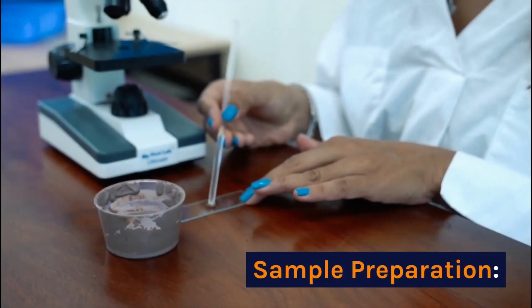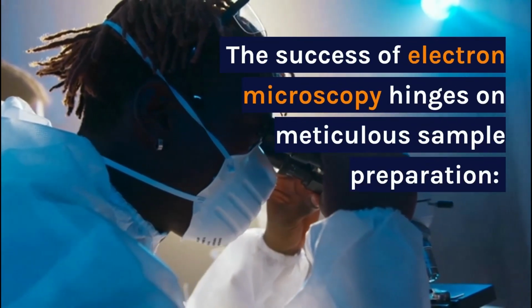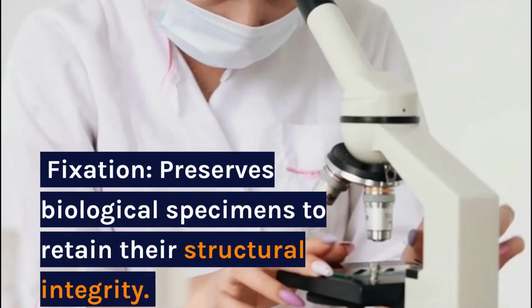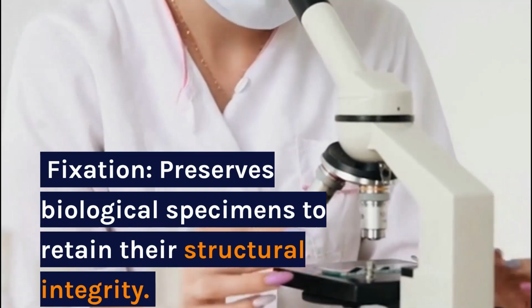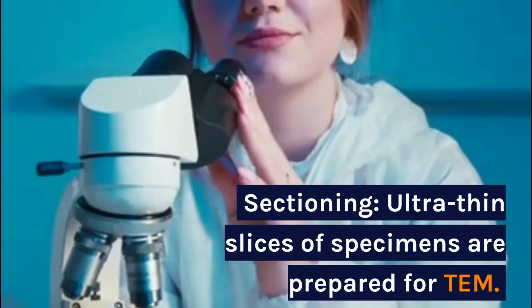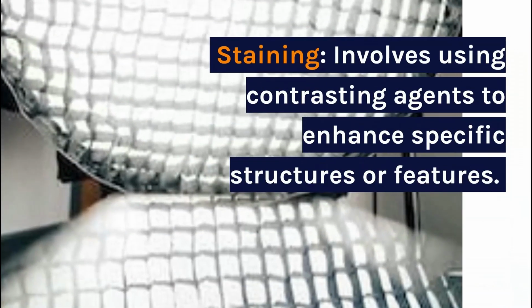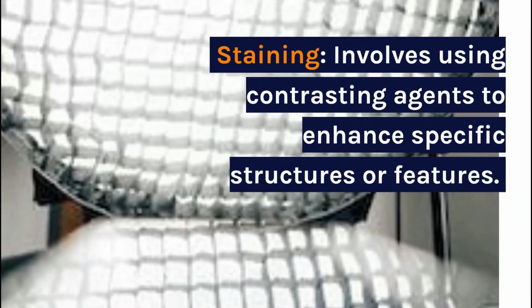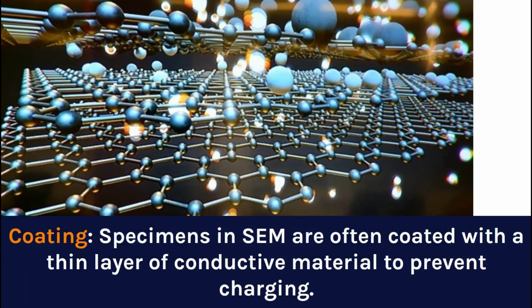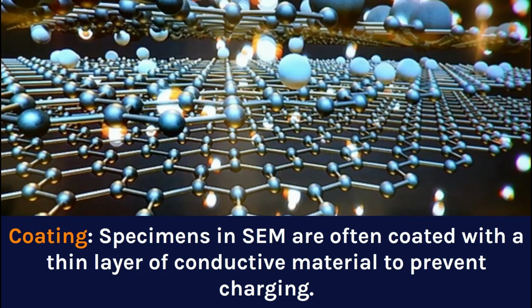Sample preparation. The success of electron microscopy hinges on meticulous sample preparation. Fixation preserves biological specimens to retain their structural integrity. Sectioning: ultra-thin slices of specimens are prepared for TEM. Staining involves using contrasting agents to enhance specific structures or features. Coating: specimens in SEM are often coated with a thin layer of conductive material to prevent charging.